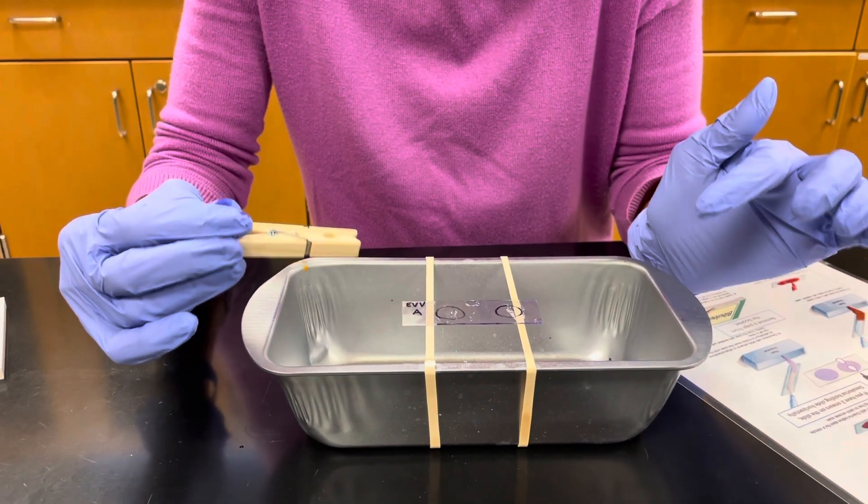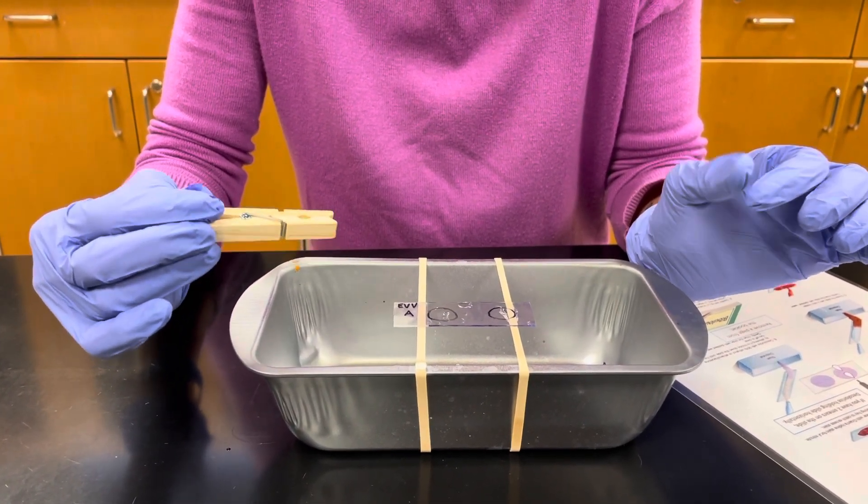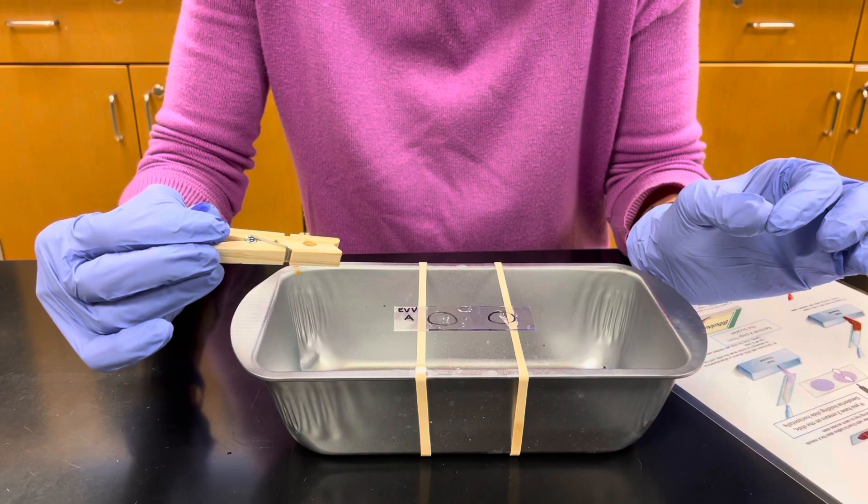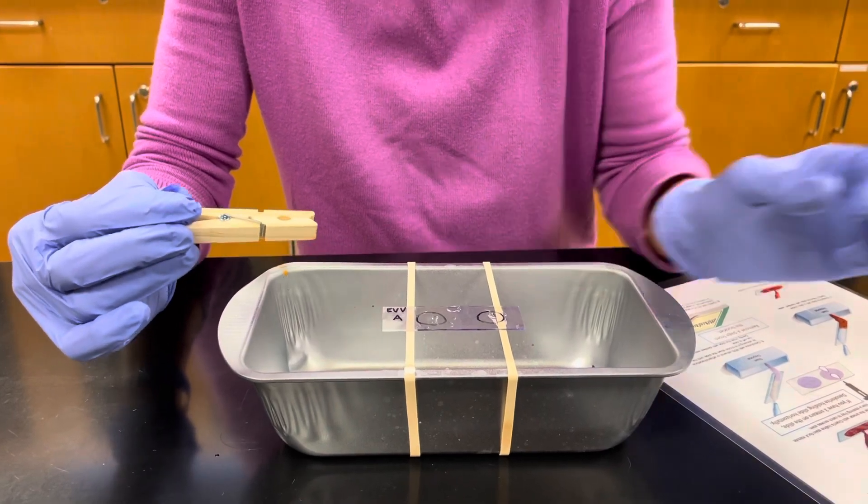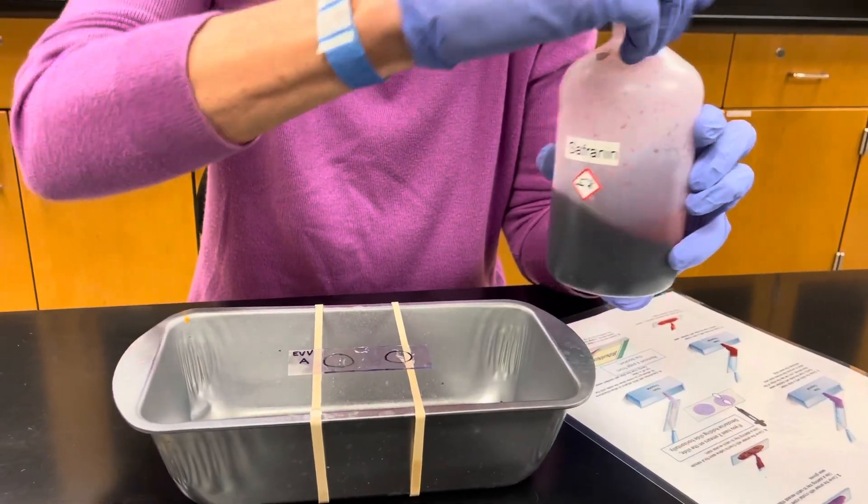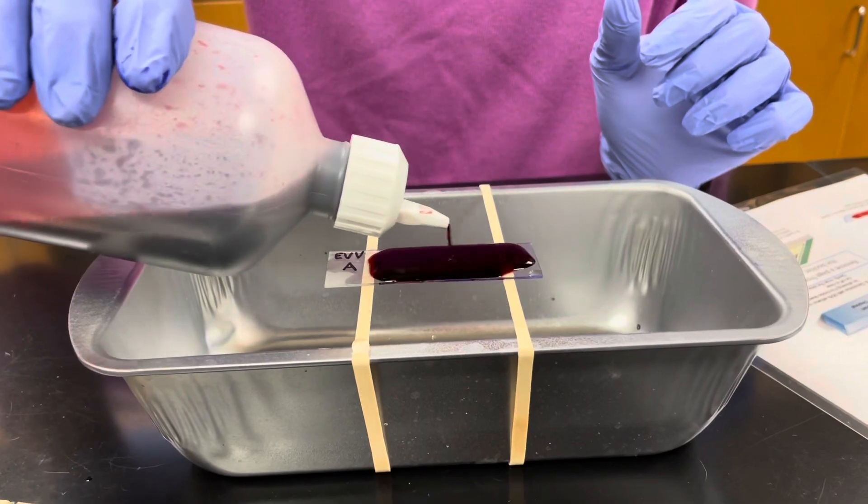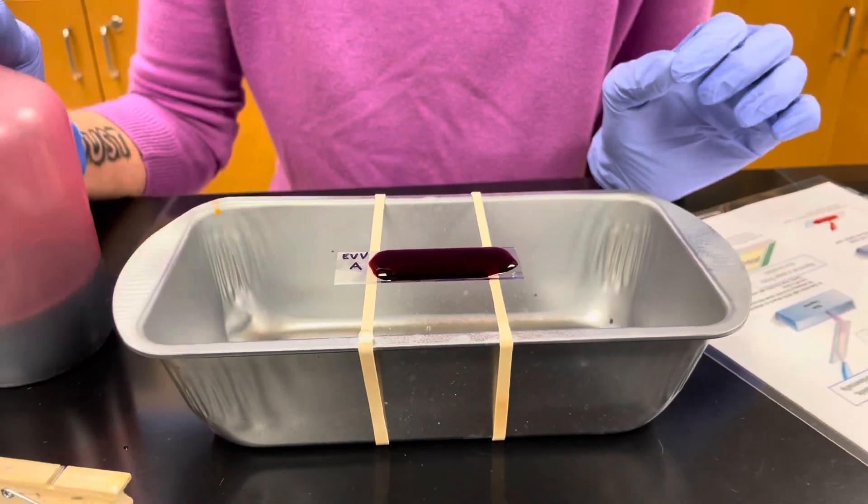Once we've rinsed off our decolorizer, our Gram positive cells are purple but our Gram negative cells are colorless so we need to add the counter stain. Our counter stain is safranin. So go ahead and flood your smear with the safranin. You're going to let this sit for one minute.